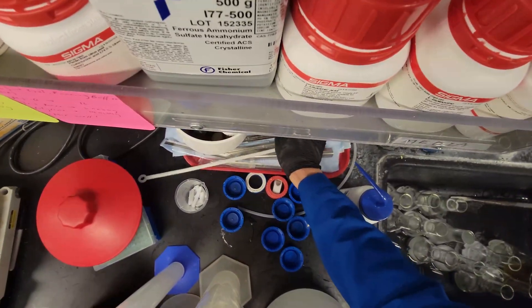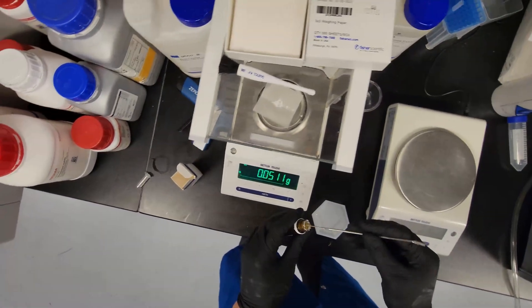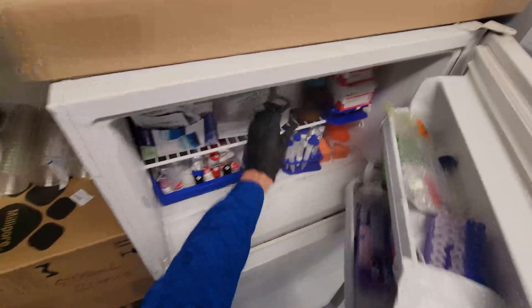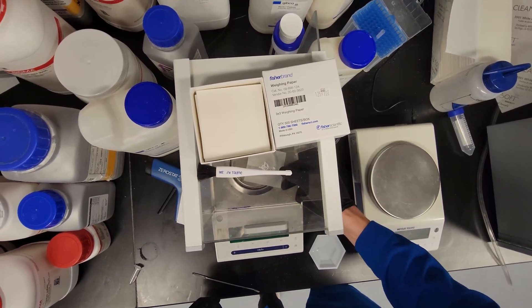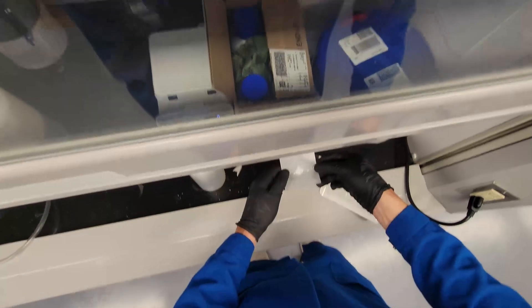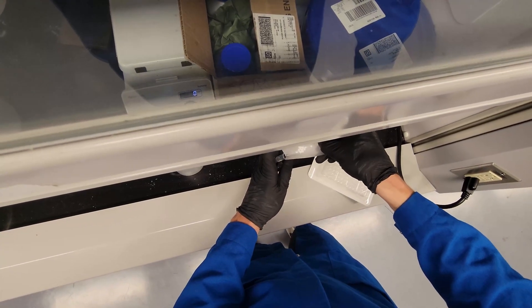We want baby scooper. Baby, baby scooper. See, if I wasn't recording, I would have just done 52. All right. Whatever. Close enough. I don't know whose liquid that is, but that's not good. All right. Put that back. Quickly put this in the tube. Again, this decomposes with light and temperature. Ow. All right. Close enough.